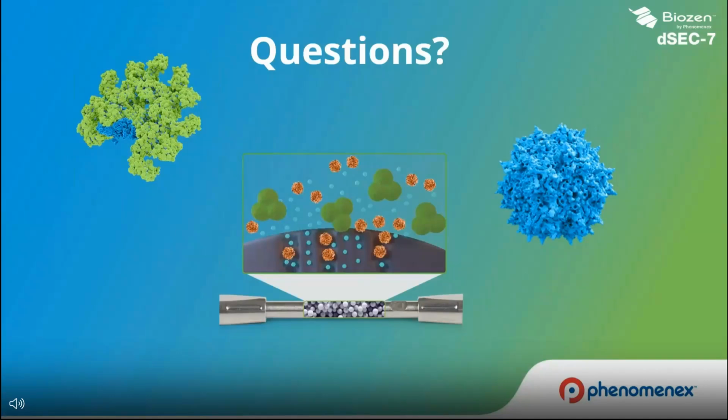That's very helpful. I have another question from a customer. He's asking, currently I'm using ultracentrifugation technique for AAV size variant analysis. I'm looking to transition to size exclusion. What are the things to expect? And what are good starting points for me?